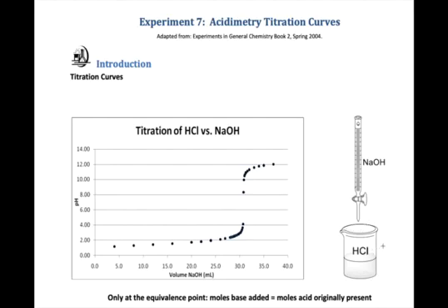It's a strong acid. In this case, it would be either a concentration we don't know at all, or perhaps it's only known to one significant figure and we want to know it to much more precision, say 3 significant figures. The titration is going to allow us to figure that out. As we add sodium hydroxide, the pH will change, so if we put a pH probe inside our beaker and a magnetic stir bar on a magnetic stir plate to mix the liquid, we can make accurate pH measurements and follow what happens when we add sodium hydroxide.